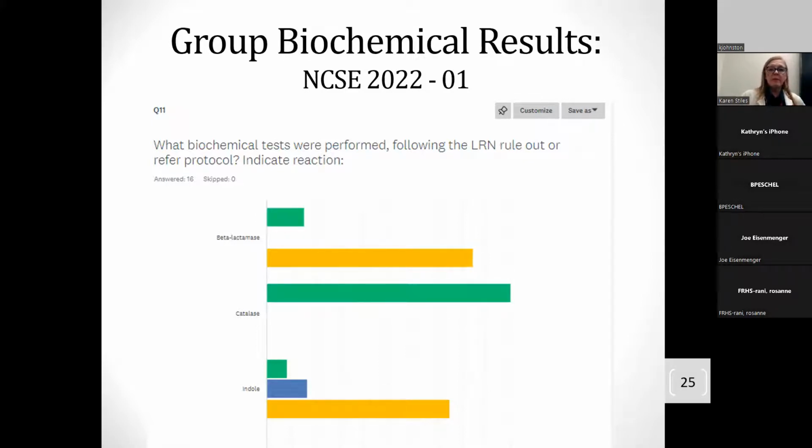Yes, there are a lot of different biochemicals listed in those books, but are you doing every one? No. Think about back when you were a student. More than likely, your teacher would say, you don't do every biochemical in the book. First of all, it takes too much time. Secondly, you work from the workflow charts to see what is appropriate.